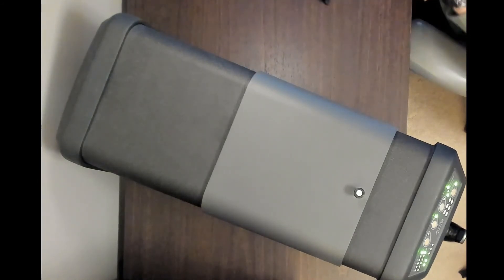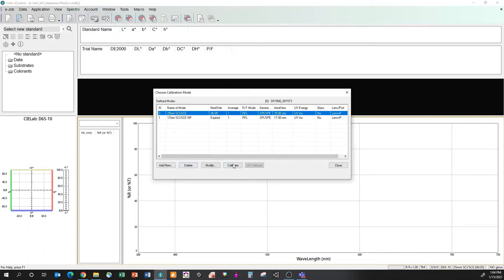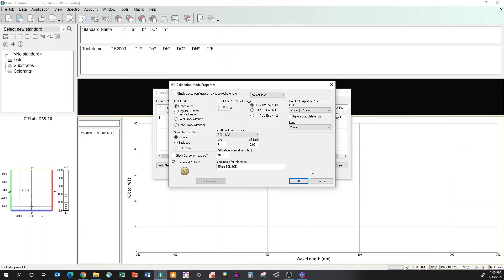Now let's look at how we configure the device — remember all those lights and buttons on the front. I'm in our IQC iMatch software in calibration mode. Settings like aperture size, specular included or excluded, and reflectance or transmission are all configured here. Whatever settings you make in the software configuration will be reflected on the instrument's indicator display.